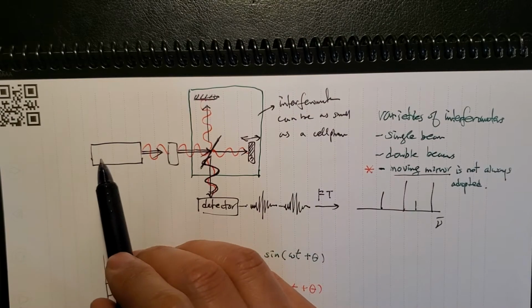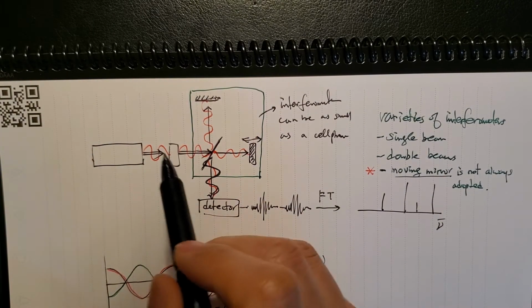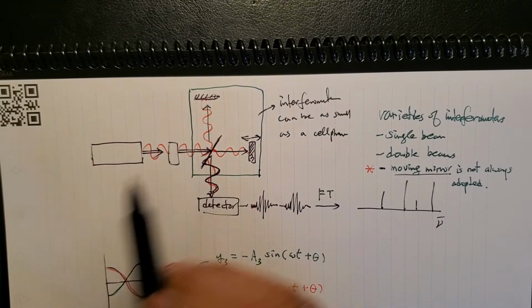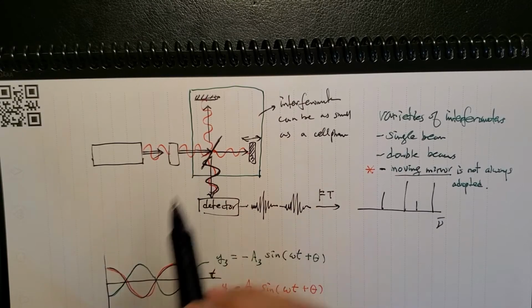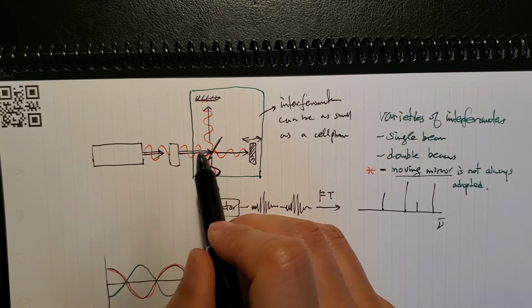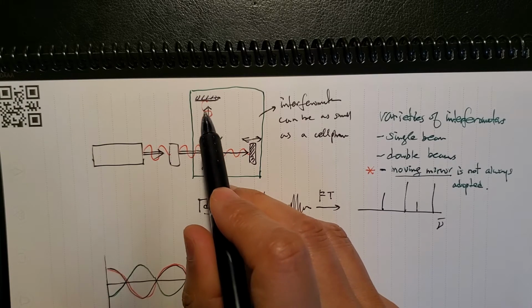So originally, say this laser is emitting one type of wavelength, for ease of understanding. So a certain wavelength of intensity goes through the sample, and whether it's absorbed or not, the intensity will change. But the wavelength, let's say, remains the same. It doesn't have to, but say it remains the same. And then the light, without changing the phase, will hit the mirror and go this way, half of it.